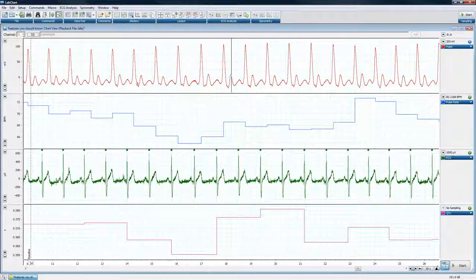Okay, so I hope the order of that wasn't too random. I tried to put it in a way that made sense, but again, these were all things that were scattered around LabChart and were sort of difficult to put in a way that made sense. But I hope that you guys watching live and those of you that are going to watch this later got something out of this that you haven't used before and you're excited to use going forward. Each of these features I've found really just increase the versatility and the use of LabChart, and these are all things again that we found, as a company, were underutilized and things we really like to see.